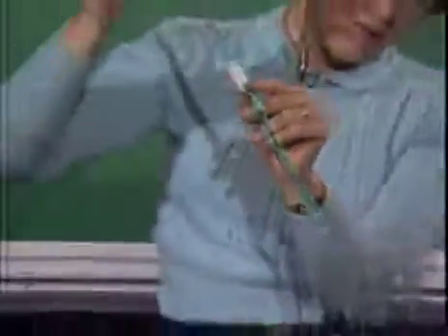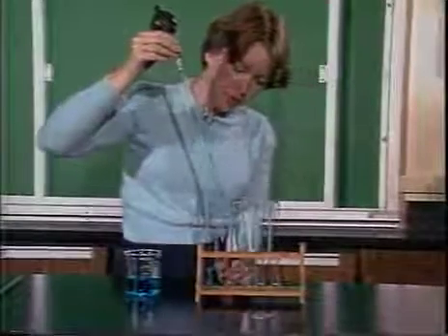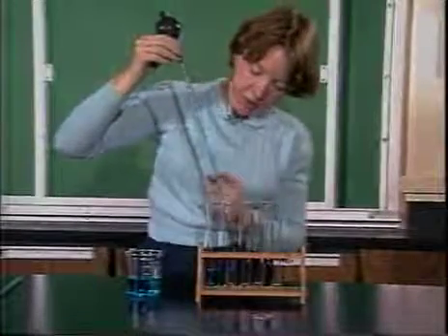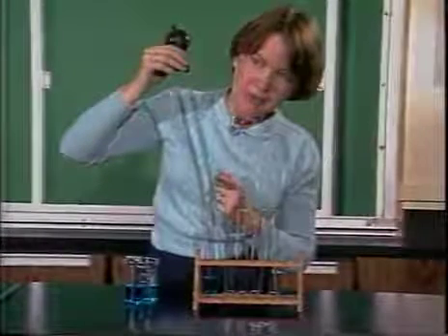Again, I need to check the fluid volume to see that the meniscus sits on 0. Then I move the pipette over to the tube into which I'm going to empty 7.5 mLs. This time I am going to empty the tube down to 7.5 right here on the pipette.